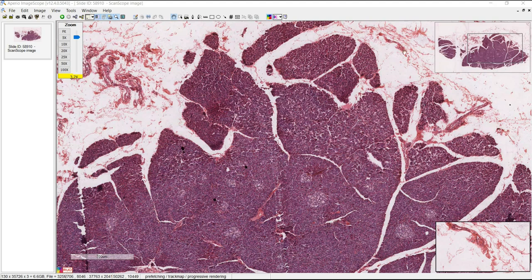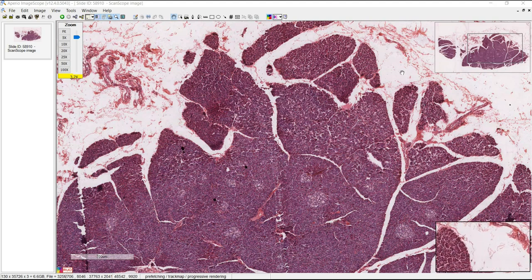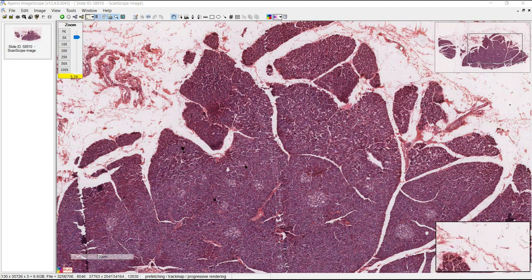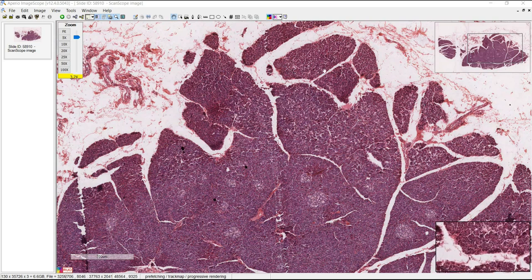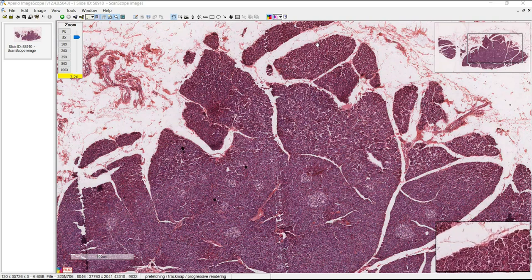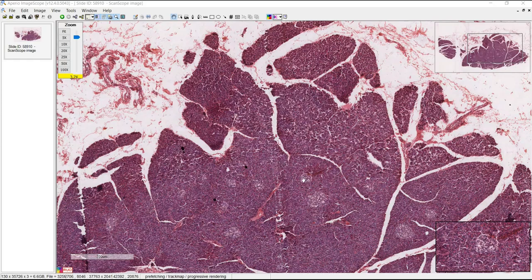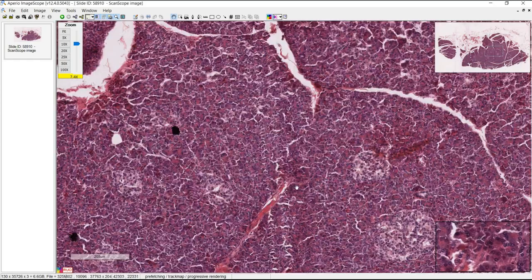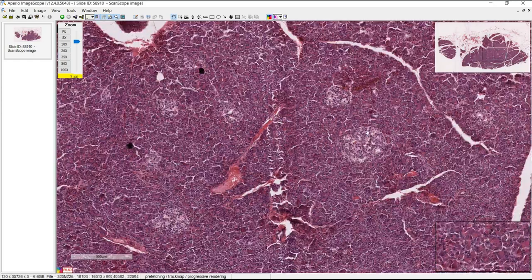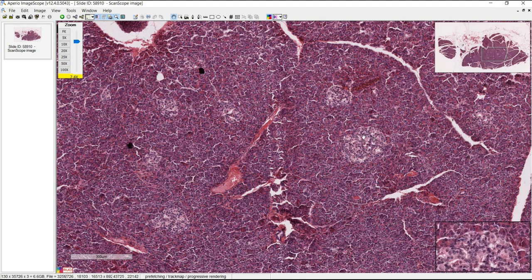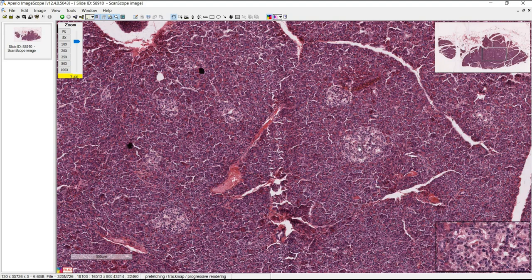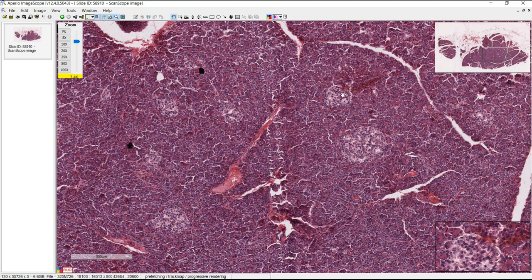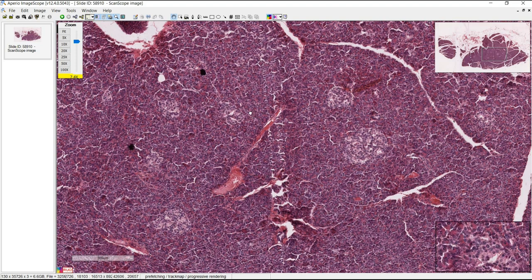Let's talk about the pancreas. This is an organ surrounded by connective tissue, arranged in lobules. You know you're in the pancreas if you see islets of Langerhans — that's unique to the pancreas. These are little circles of lightly staining cells scattered throughout the tissue.